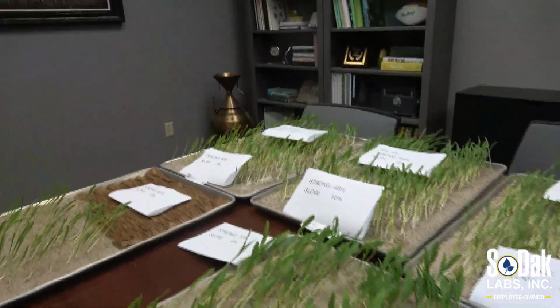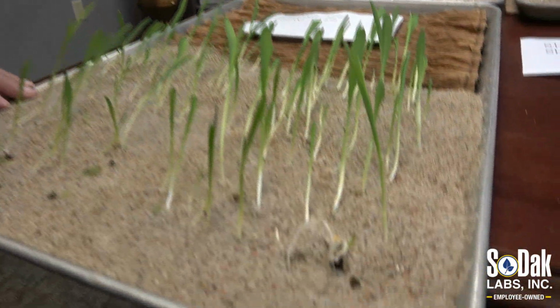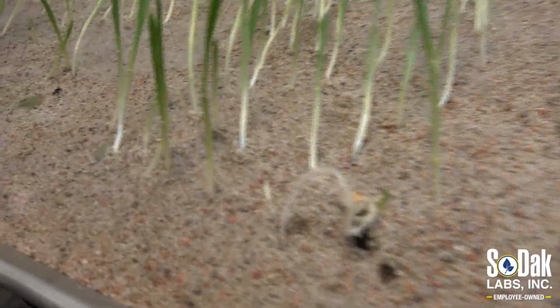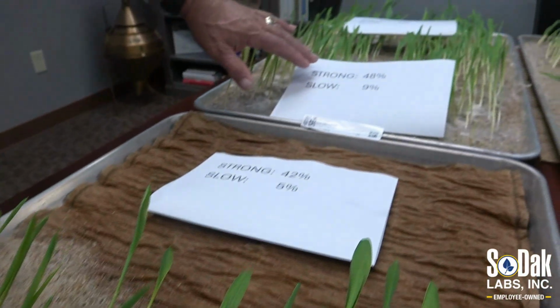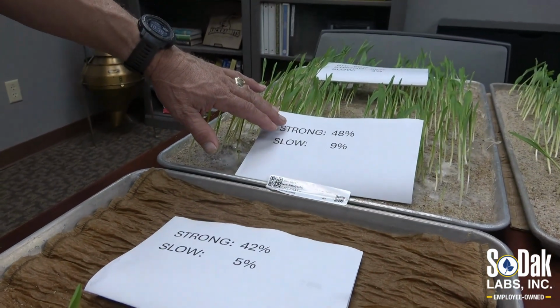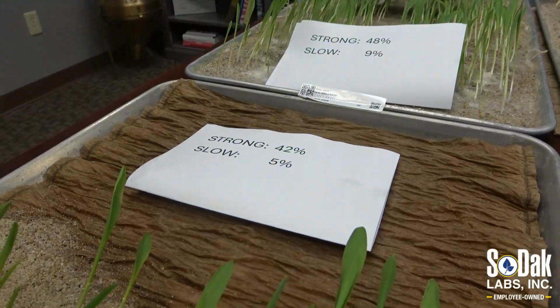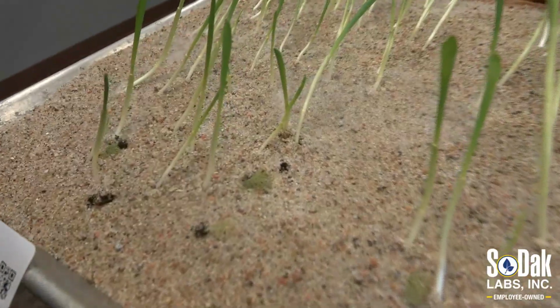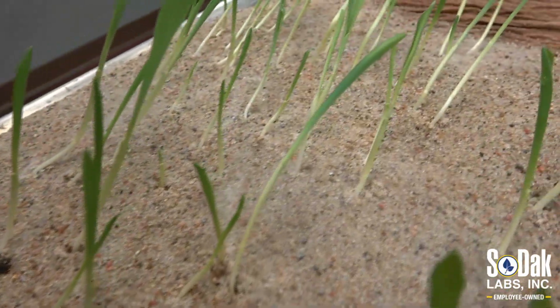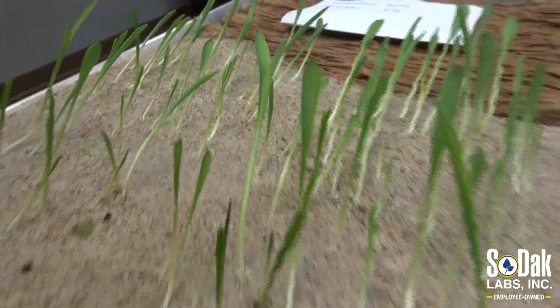But the most interesting thing is this last tray. What we see here is this is our 90% warm lot with a lot of Rhizopus, had a 57 tray cold on a 50 Fahrenheit cold, but comes in at a 47 accelerated aging. That loss of sugars represented by the saprophyte is really showing up in the accelerated aging.